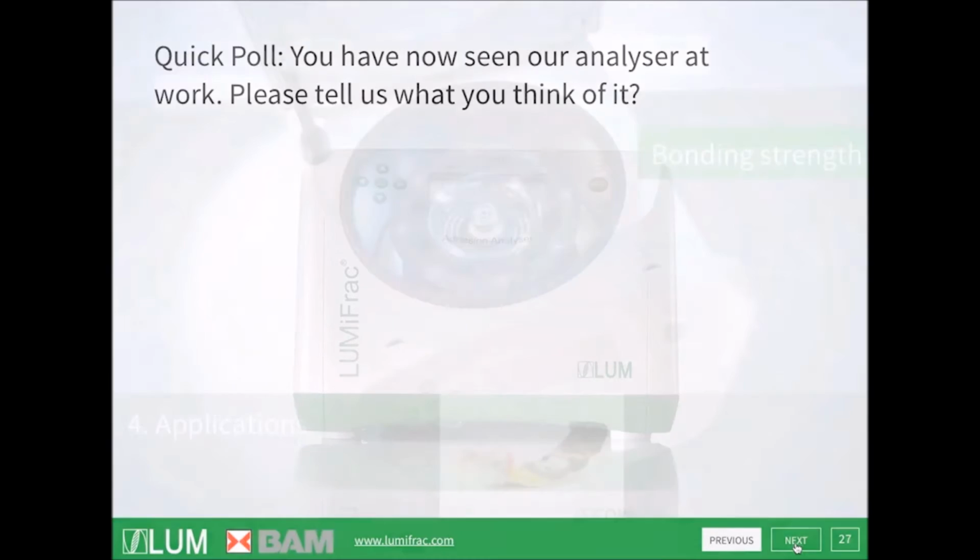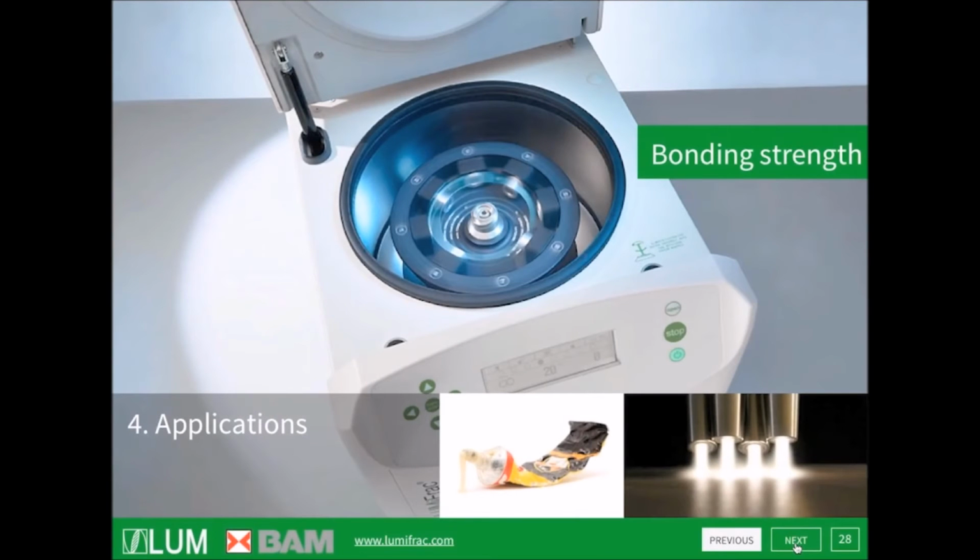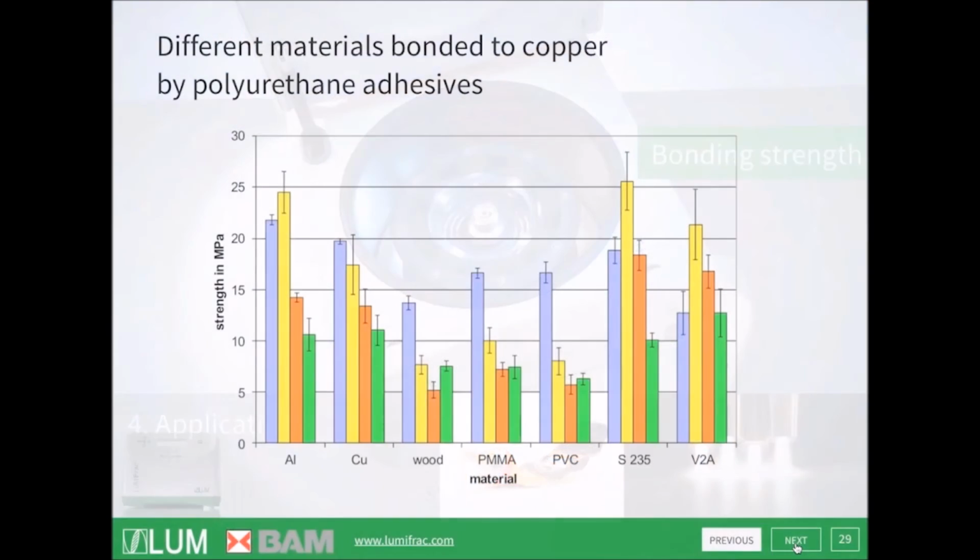Yes, I will do so, thanks. So, as already mentioned, let us discuss now some applications. We will begin with examples for the determination of bonding strengths. The first example is a comparative study on different materials bonded to copper by polyurethane adhesives.